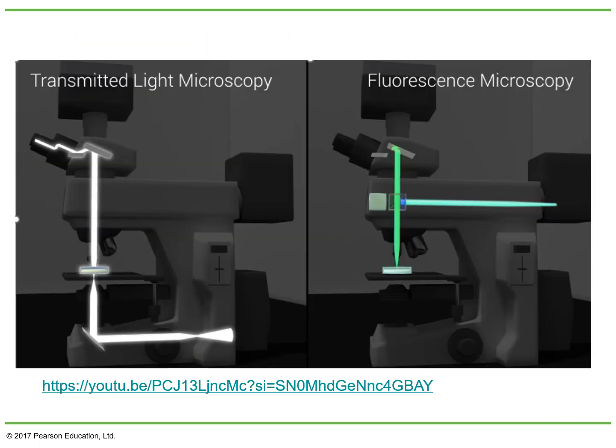Okay, now that we know what fluorescence is, I can show you how fluorescence microscopy works. To do that, I have this great video that I found that was very useful for me to understand this. In the beginning, they compare it to transmitted light microscopy. Here they illuminate from here, it goes through the sample, and later you end up seeing that with your eyes in the eyepiece.